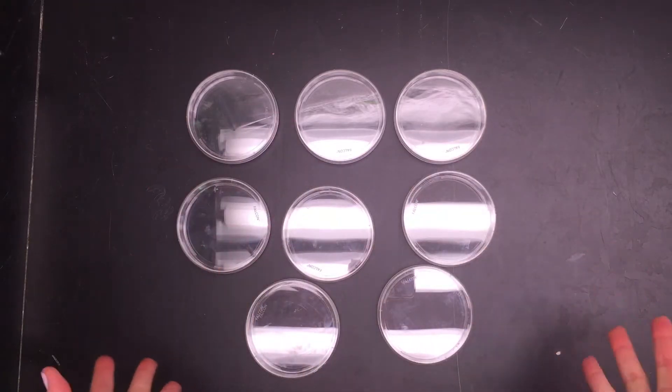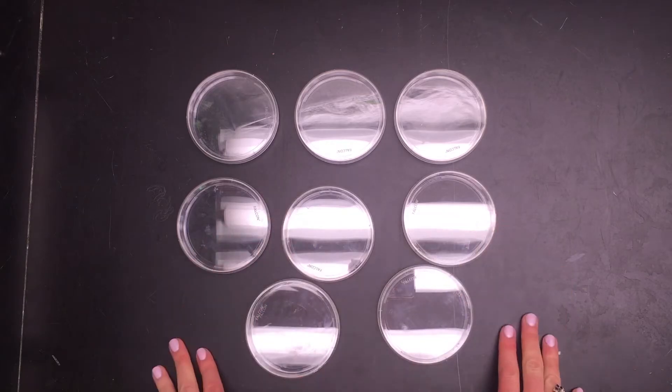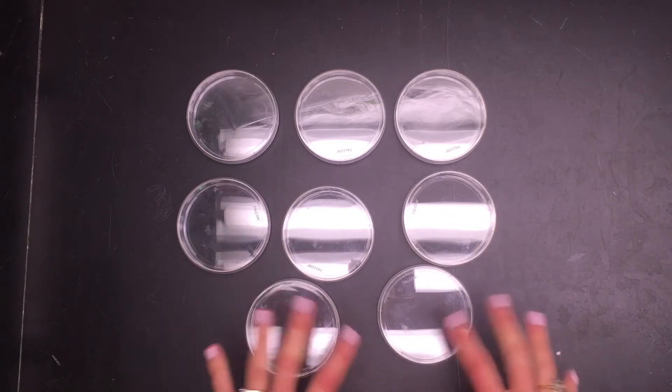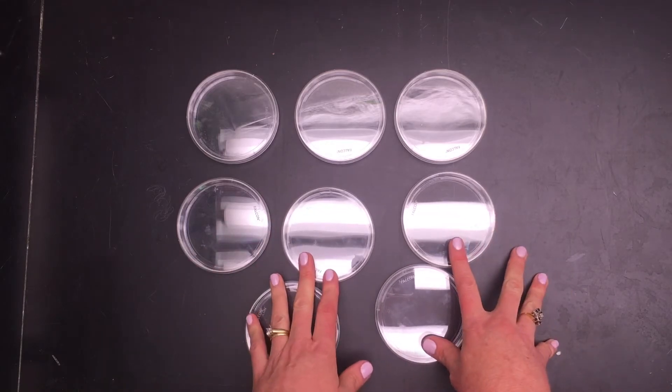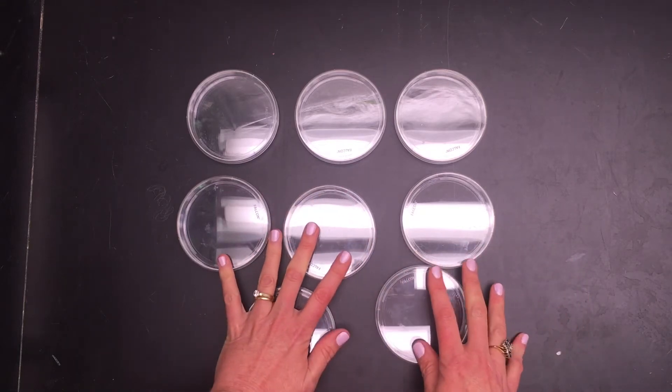You want to use enough petri dishes to get good data, so six to eight petri dishes are a good idea just to make sure that you have enough data to draw some conclusions and to really test if your hypothesis was correct or not.